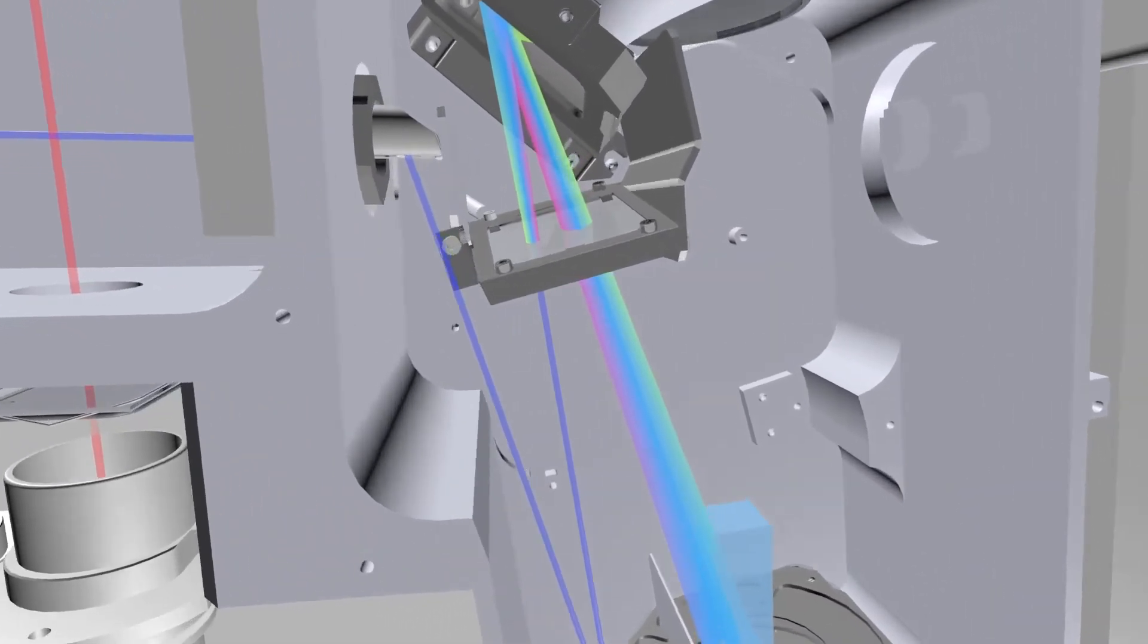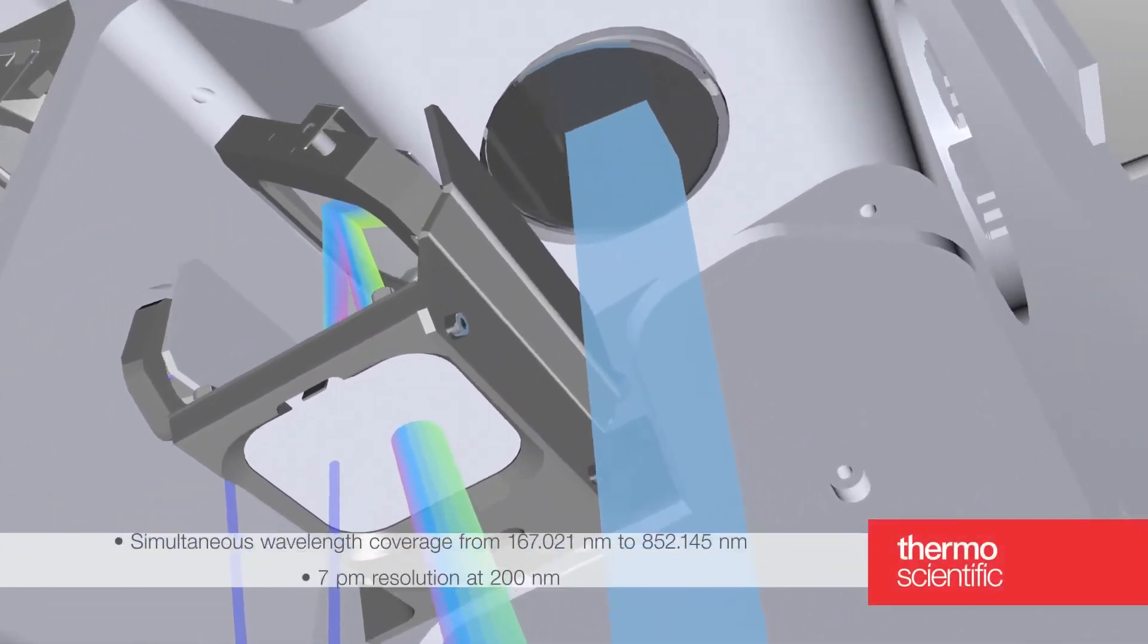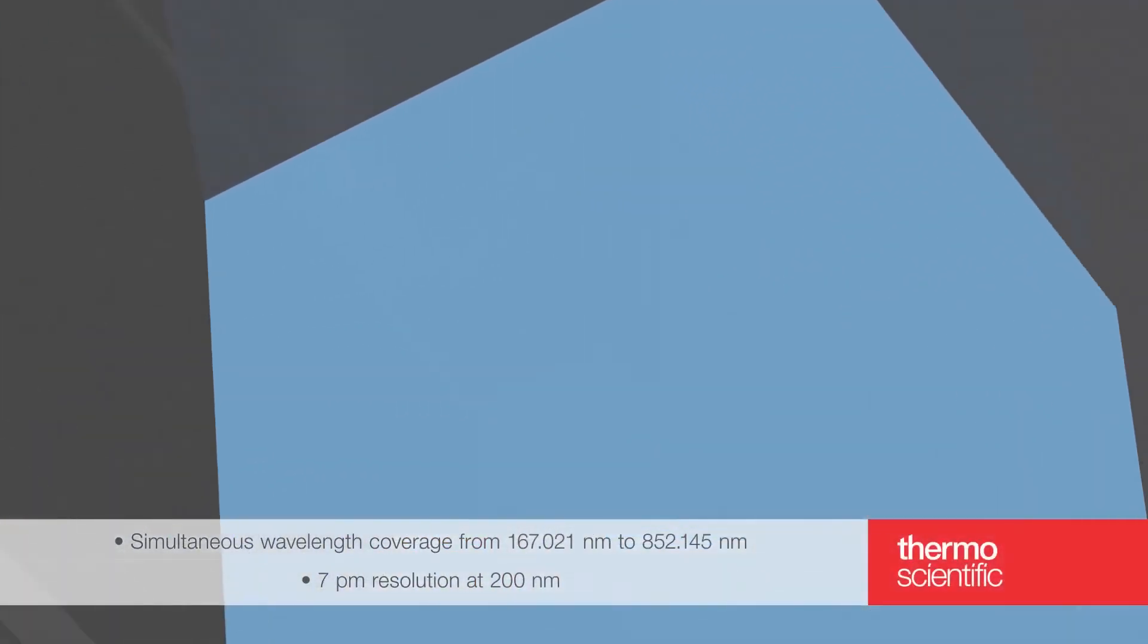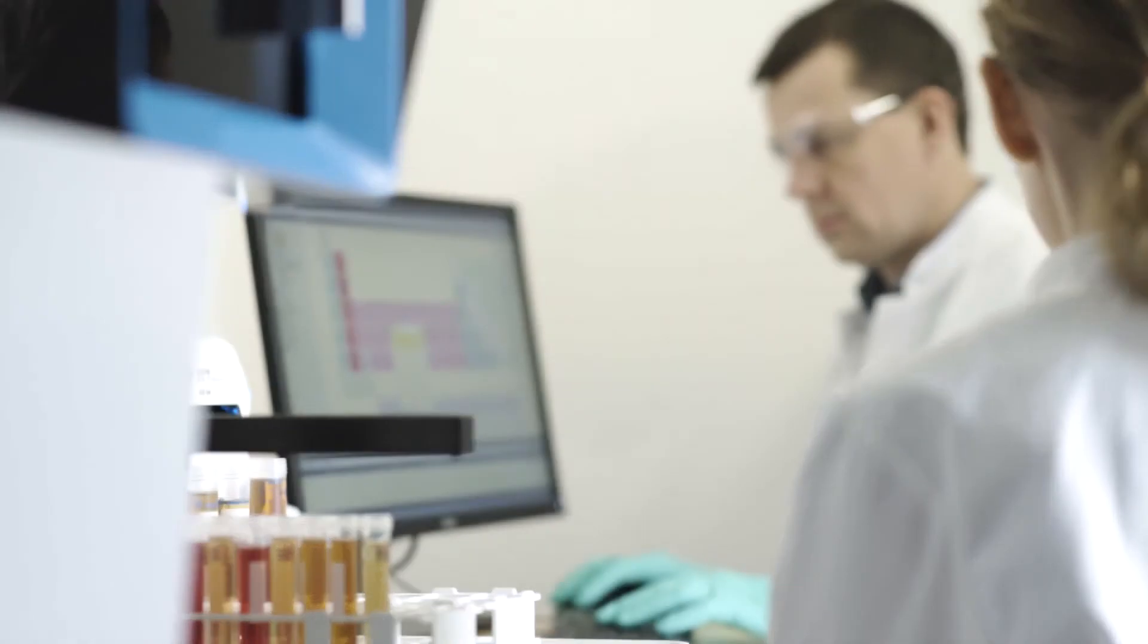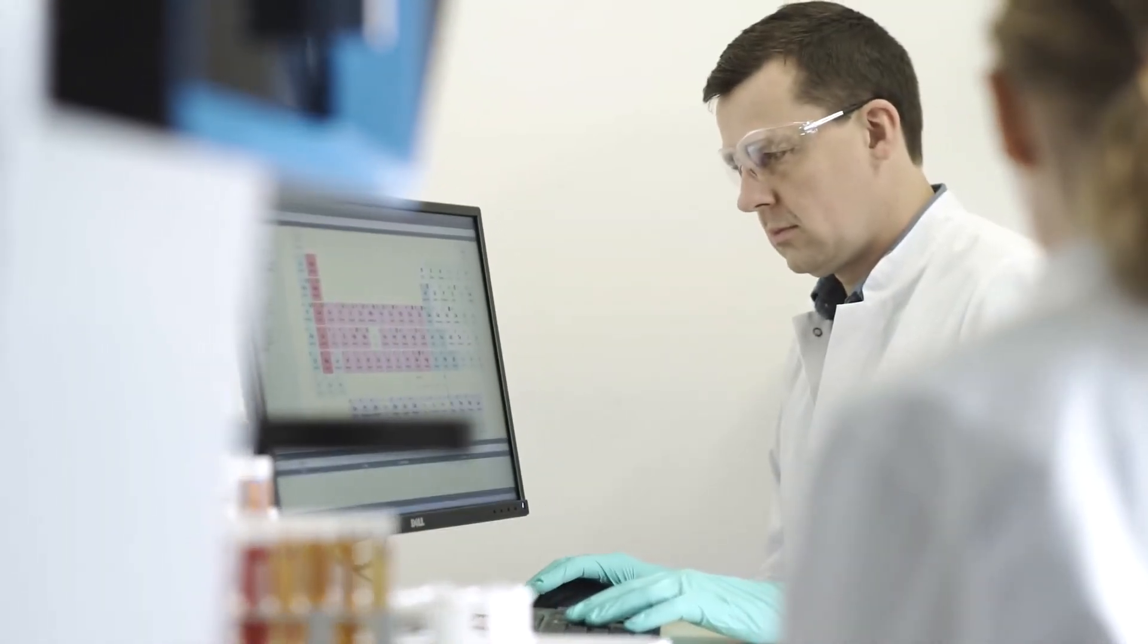The intelligent full-range analysis mode captures the entire spectrum in one exposure. The iCAP Pro ICP-OES series features a vertical plasma interface.